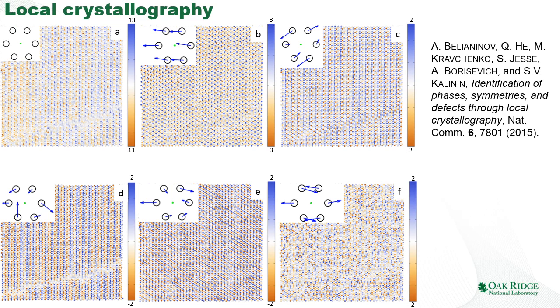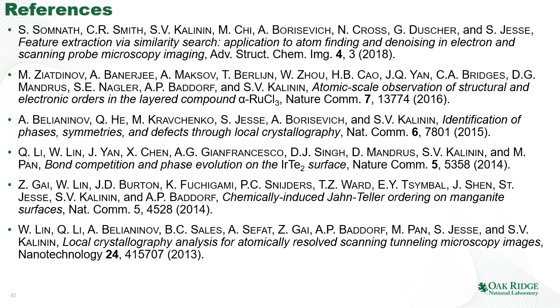But for the time being, you're welcome to learn more about the local crystallography in this publication. This is the general collection of the publications on atom finding, the observation of structural and electronic orders, and the phase identification, so you're welcome to look at those in more detail.